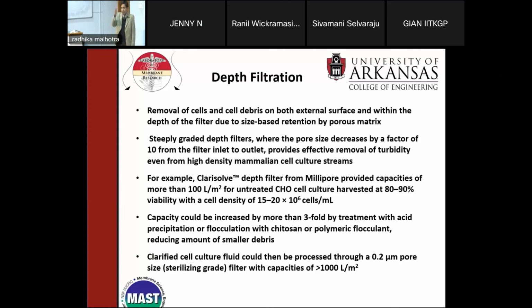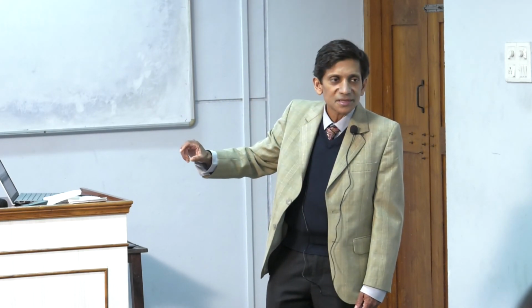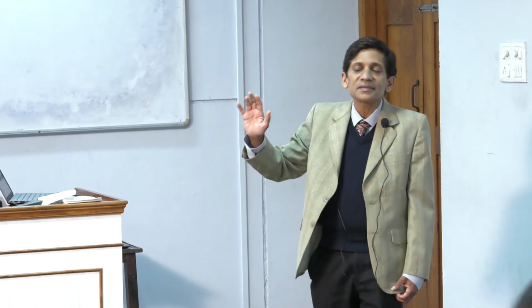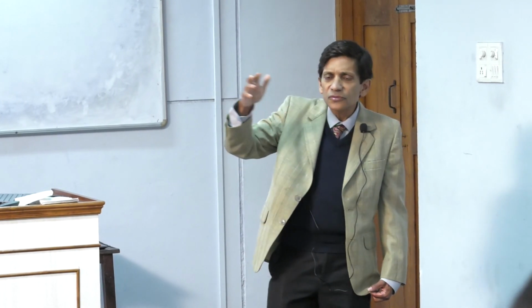We have a number of different steps used for virus filtration, but regulatory authorities say they have to be what they call orthogonal, which means I can't say I had a virus filter that removes, say, 3 log, so why don't I put 2 of those in series and say I've got 6 log? That will not pass. Because the argument is this: you remove 3 log, and presumably some viruses went through.